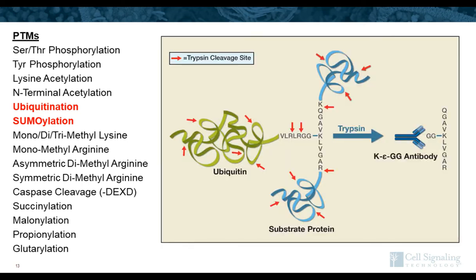So this is just a picture of a ubiquitinated protein. The target protein is in the middle in blue, and the ubiquitin is on the left in green. And you can see you have attachment of the ubiquitin to an epsilon amine of that lysine residue in the middle of that target protein. When we take and digest this with trypsin, what we end up with is, of course, a peptide from that target protein. But any place where we had a ubiquitination event, any of those lysines, we actually end up with a diglycine remnant. And so we made one of these PTM antibodies against that diglycine hanging off of a lysine.